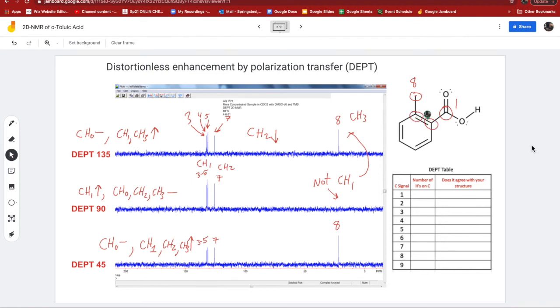They're not showing up on this spectra, so I said it's 6 or 2, and this one is 2 or 6. All right, and then we've got these other ones. We'll call those X, and those are the CHs, all these CHs here. So those again are X equals 3 or 4 or 5 or 7. Okay, so I got that labeled.